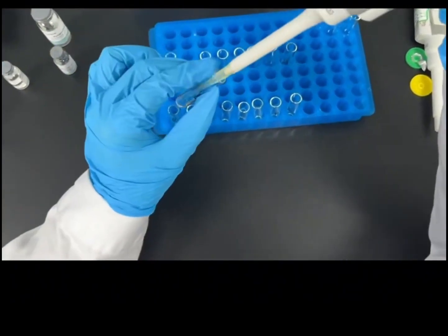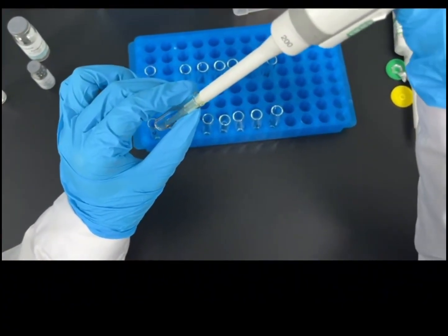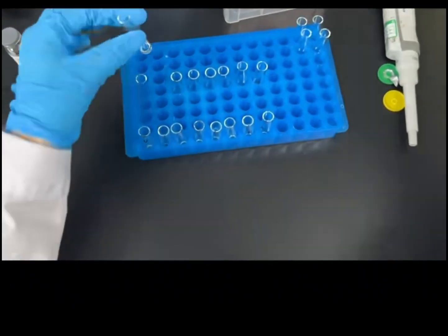Place the tubes vertically into a thermostatic water bath at 37°C. Incubate the reaction for 60 minutes.